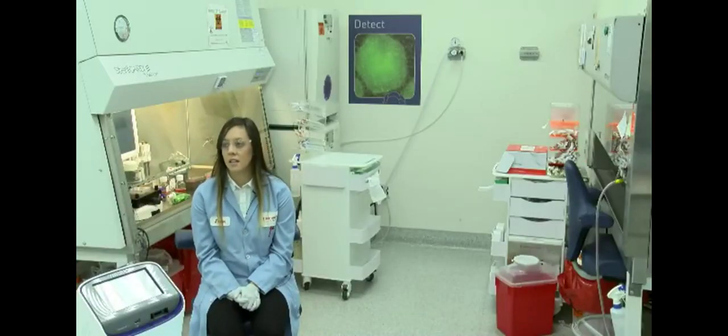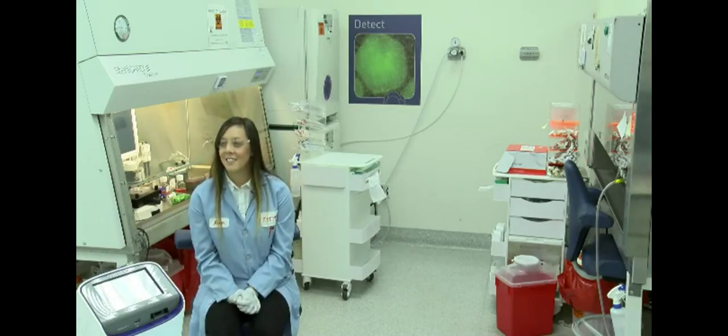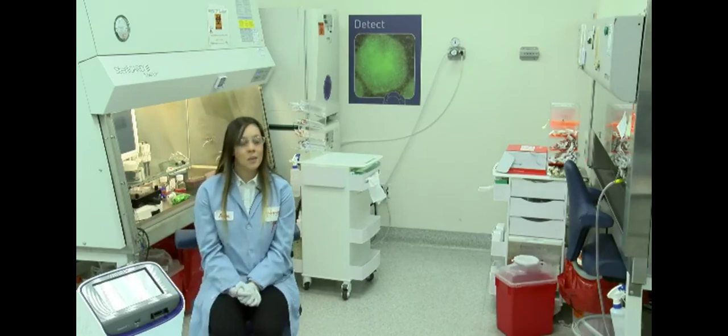So have you used these neurons in a high content type environment where you're using them for screening? Sorry, have you used the neurons in high content type assays for screening? Yes, so we have used these neurons using our Cell Insight CX5 and CX7, which are our high-throughput imaging systems. These neurons are very clear, and they're very homogeneous, and they're spread out. So our system actually finds a cell body before it finds axons and other types of stains, depending on what assay you're running. Because this population is very sparse and uniform, they provide a perfect thing for high throughput imaging. All right. Thank you, Jordan.